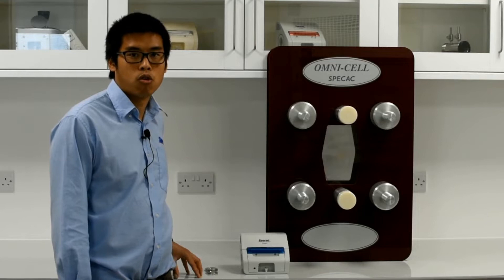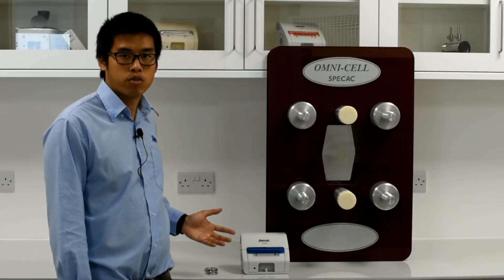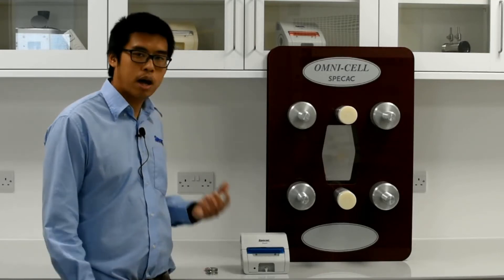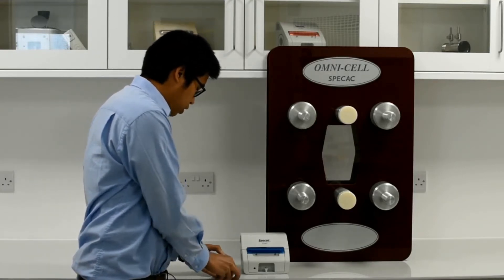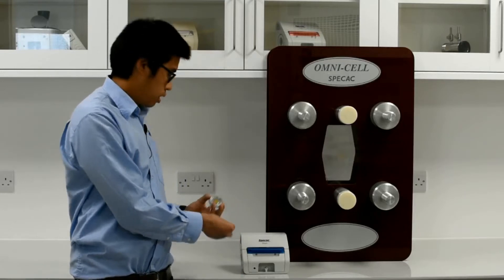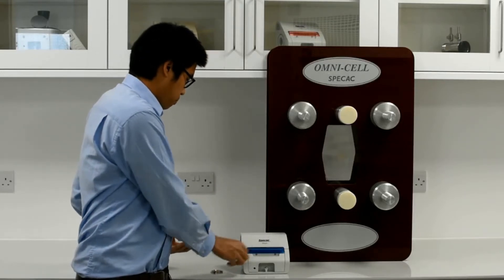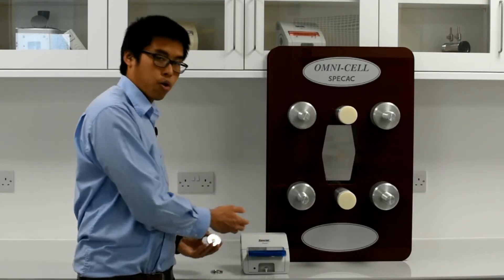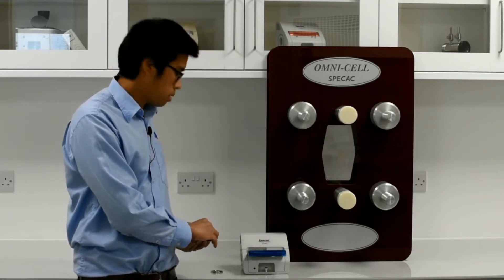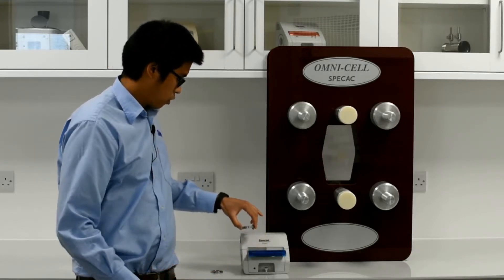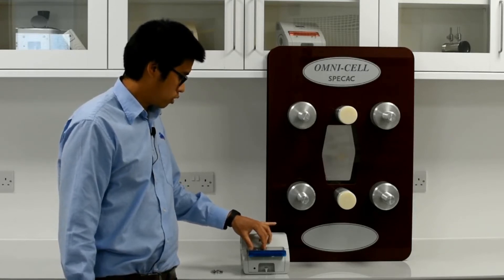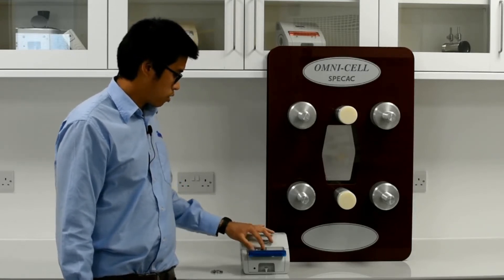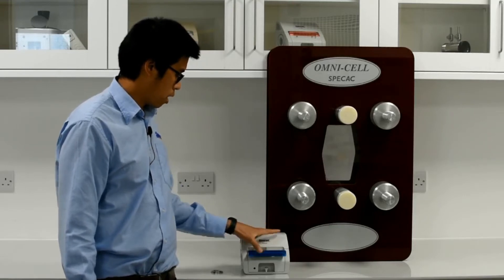We provide two different types of optical materials for the Pearl liquid transmission cell: calcium fluoride and zinc selenide, and these go into the oyster cells you see here. Essentially you put the bottom window into the Pearl optical unit, put your liquid onto the bottom cell, and then the top cell to sandwich the liquid sample between the top and bottom oysters.